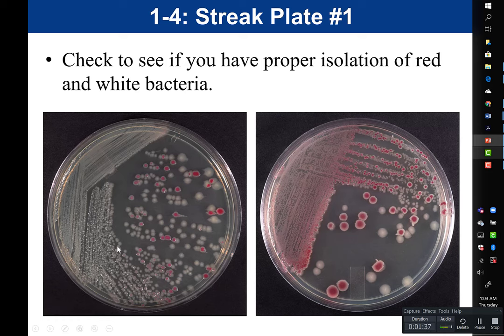Notice that the technique is a little bit different for how each plate's quadrant streaks were done — people do their quadrant streaks slightly differently, but they can ultimately get the same result. One plate has a lawn for quadrant one followed by directional streaks; the other uses more of a zigzag pattern. Both plates ultimately achieve the same goal: isolated red and white colonies. Both would be considered successful streak plates.